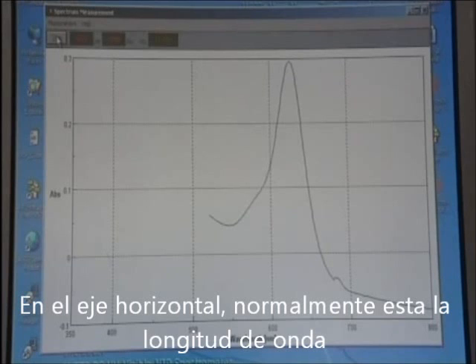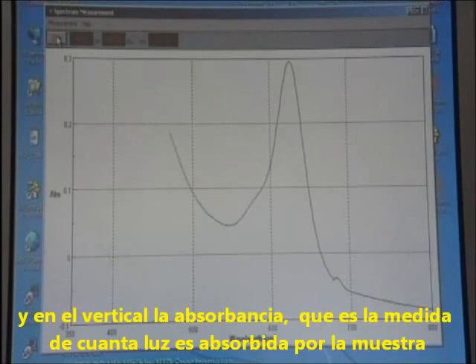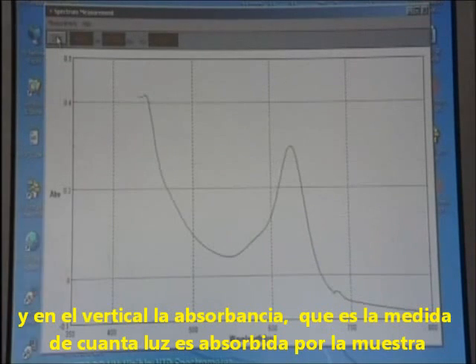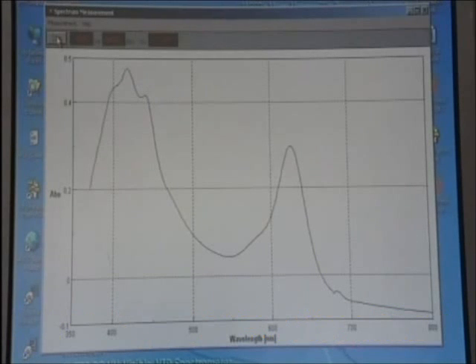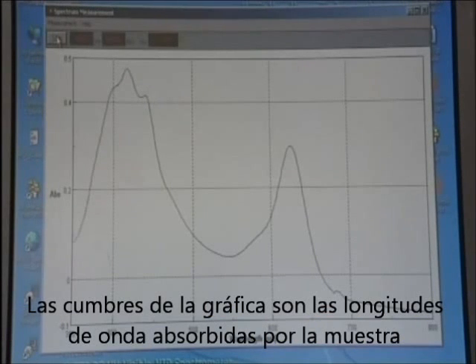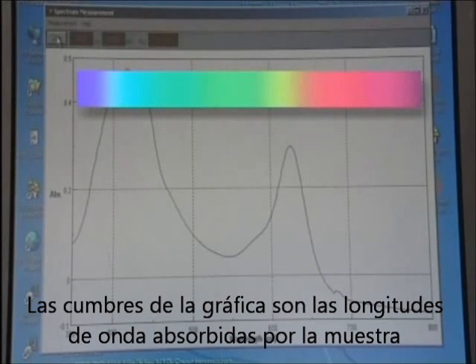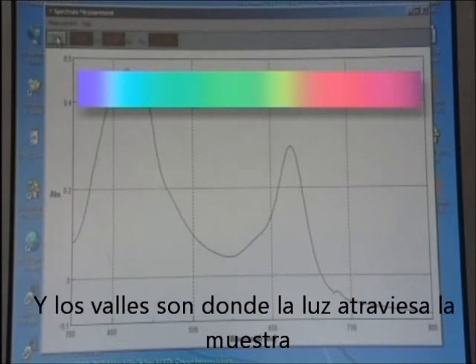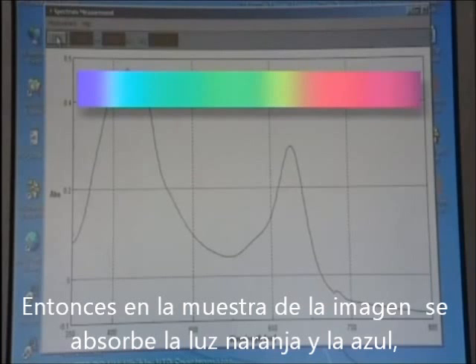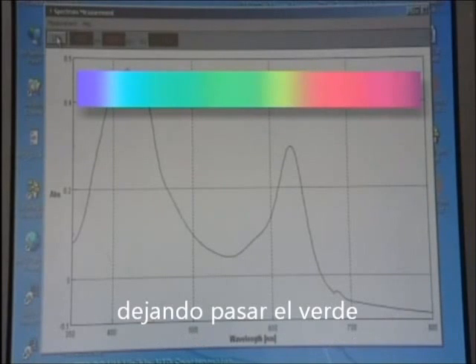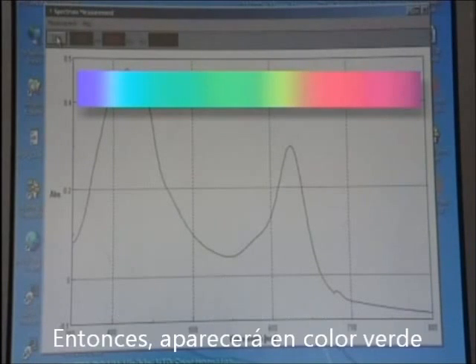The horizontal axis is normally wavelength and the vertical one absorbance, which is a measure of the amount of light absorbed by the sample. The peaks on the spectrum are the wavelengths of light that are absorbed by the sample, and the troughs are where light passes through. So the dye absorbs orange and blue light and lets through green, so it appears green in colour.